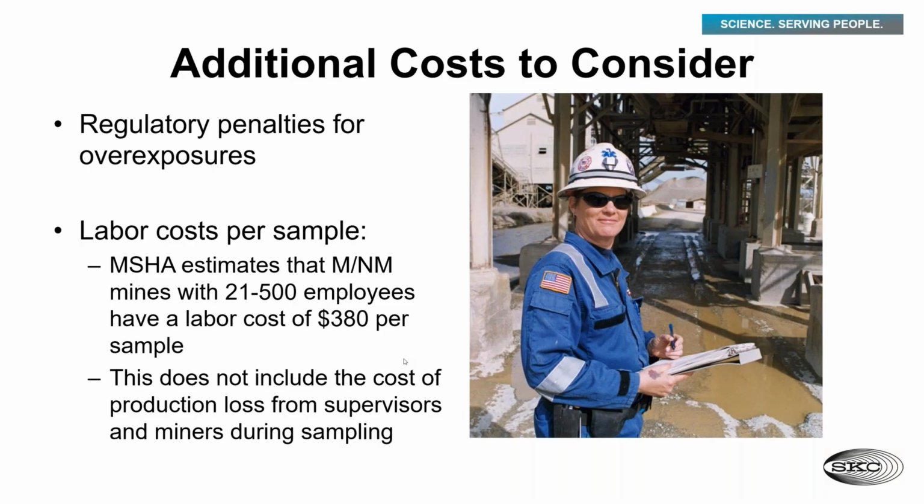That is your time, part of your salary, the travel to and from work, all the things that go into taking that particular sample. So when you start thinking about samples that are invalidated from, say, a cyclone tipping upside down or your pump dying halfway through the shift, those costs add up relatively quickly.